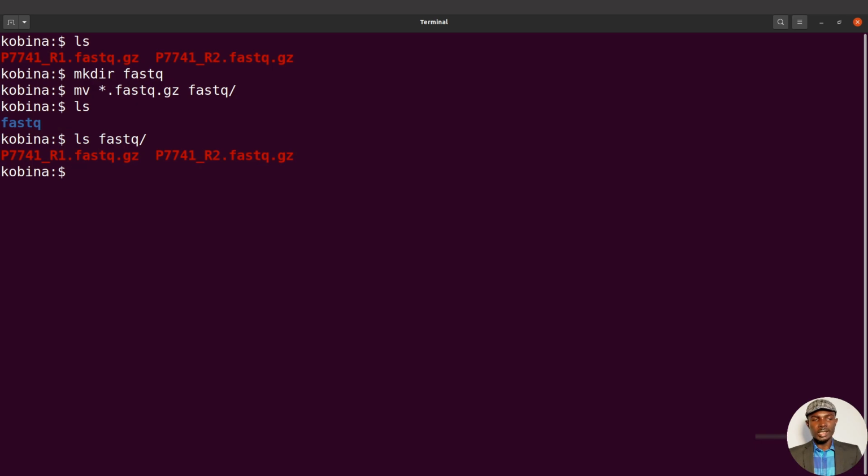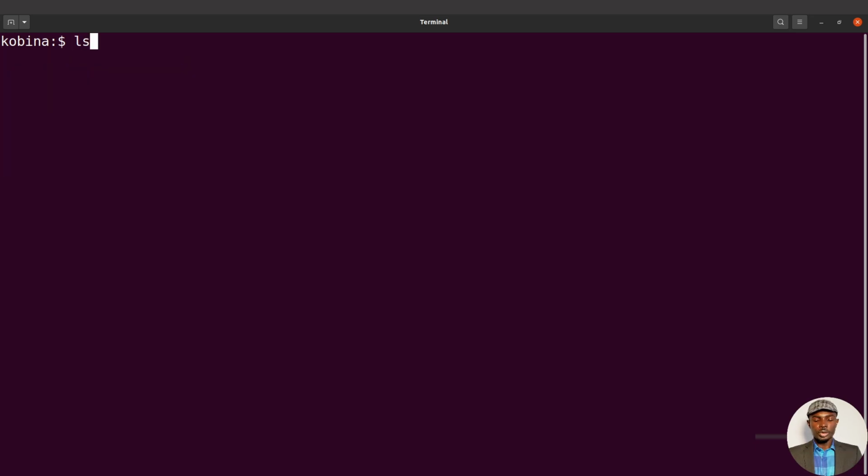All right, ladies and gentlemen, we now have our example data, so we can start. We are now going to write the Nextflow scripts to perform the quality control. So let's clear the screen and continue. I'll do an ls again and then proceed.